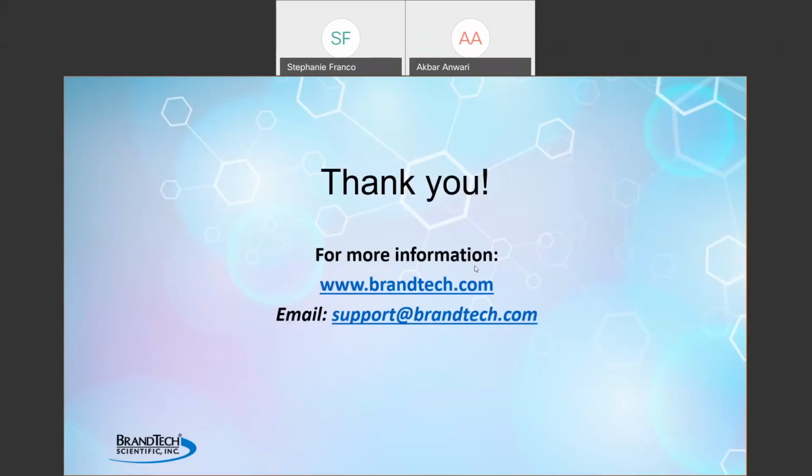That's an excellent question. Your typical carboy has a pretty large cap on it. I believe it's an 83 millimeter threaded cap, and that's larger than our largest thread adapter that's available for the instrument. The easiest way that a number of people have done is if you get a hole saw, which is a specialized kind of drill bit, you can drill a 1 3/4 inch hole into the top of a replacement carboy cap. And then you can take one of our standard thread adapters, push it in from the underside so that the threads protrude on the top, and then you can attach the dispenser to those protruding threads.